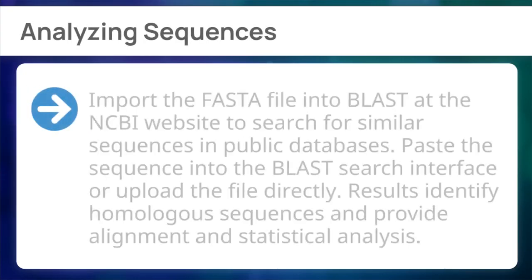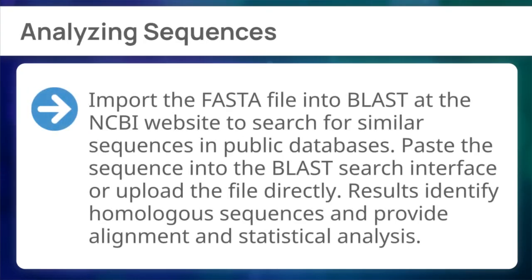Next, analyzing sequences. Import the FASTA file into BLAST at the NCBI website to search for similar sequences in public databases. Paste the sequence into the BLAST search interface or upload the file directly. Results identify homologous sequences and provide alignment and statistical analysis.